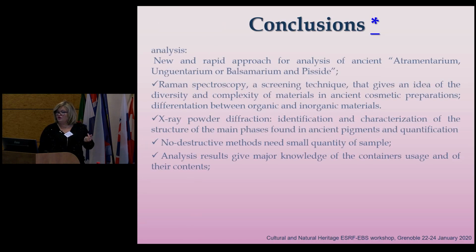In conclusion, we can say that the ancient powders found inside the ancient containers, so atramentarium, unguentarium, balsamarium and pyxis, can be studied with a multi-analytical approach, not just one technique. We are talking about just powder, and so about laser.